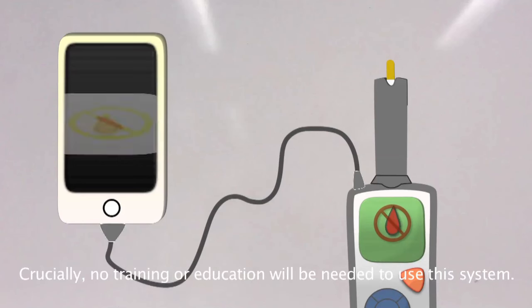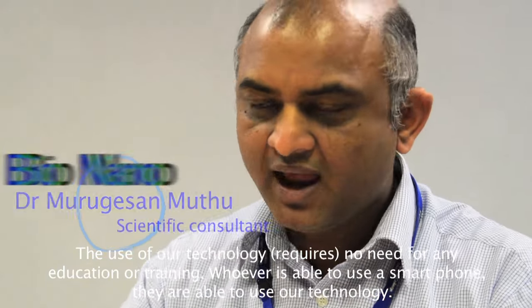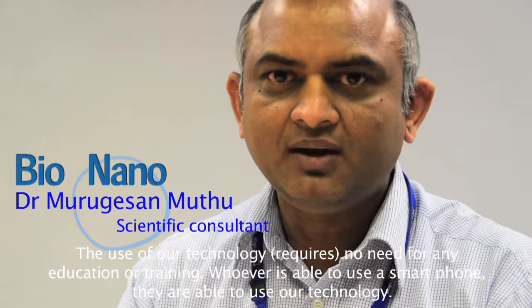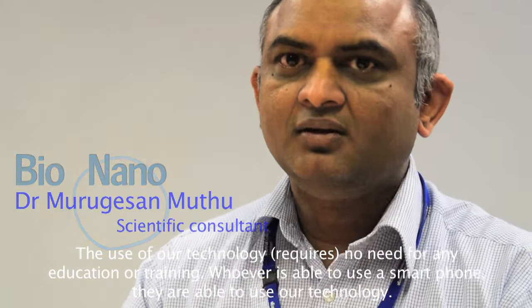Crucially, no training or education will be needed to use this system. Whoever is able to use a smartphone, they are able to use our technology.